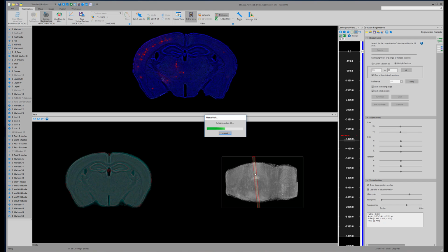The first step is that it applies a linear transform. That basically applies the dorsal-ventral and right-left angle offsets that we've determined, and it's just a linear transform, finding the best linear match.